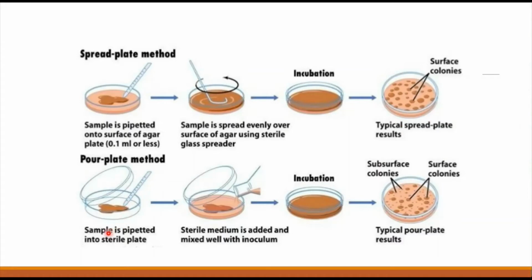Then coming to the pour plate, you are going to mix both the media as well as the organisms, and incubate it. Then you are going to have surface and submerged colonies, all of which can be counted. This is mainly used for anaerobic microorganisms, or microaerophilic organisms can be found by this kind of pour plate method technique.